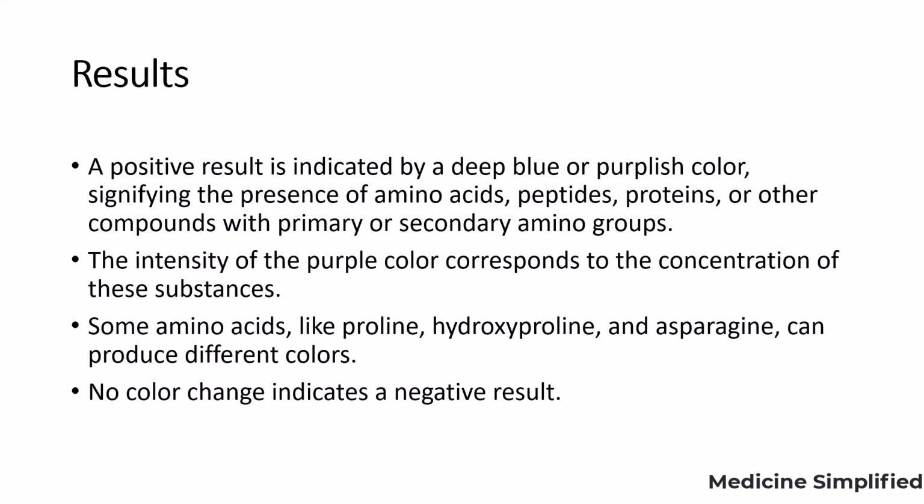Coming to the results, a positive result is indicated by a deep blue or purplish color, signifying the presence of amino acids, peptides, proteins, or other compounds with primary or secondary amino groups. The intensity of purple color corresponds to the concentration of these substances. More concentration leads to more intensified purple color. Some amino acids like proline, hydroxyproline, and asparagine can produce different colors. No color change indicates negative results.